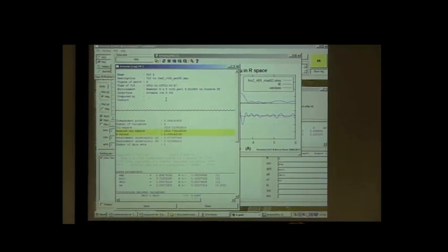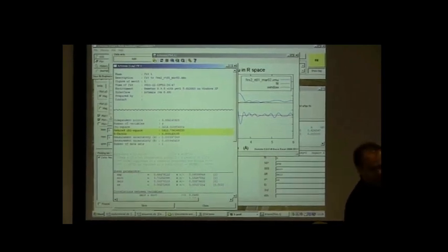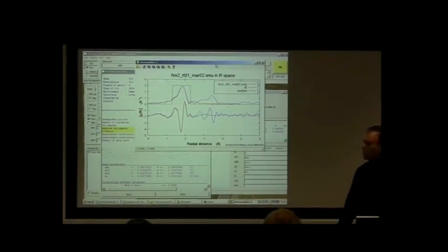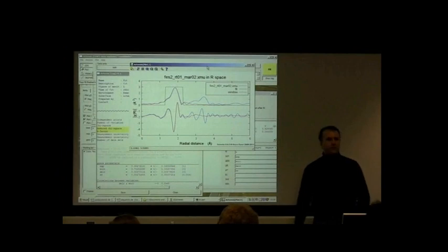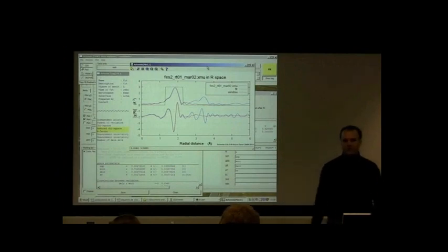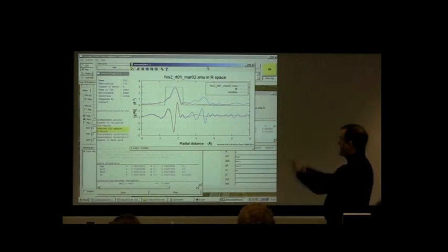And a sigma squared of about 0.003 is the sort of size of sigma squared that we typically see in EXAFS data analysis. So except for a rather small amplitude, a rather small S0 squared, all of our parameters are pretty reasonable. The fit looks pretty good. We assumed that n equals 6 was the right number, which since it's a crystal is probably pretty reasonable. And there's our analysis of the first coordination shell.